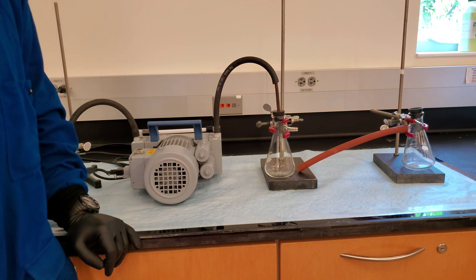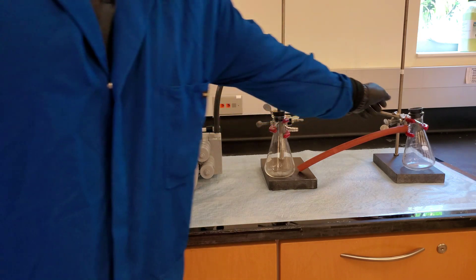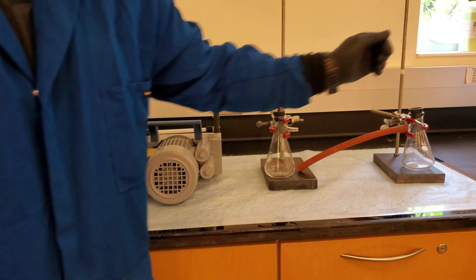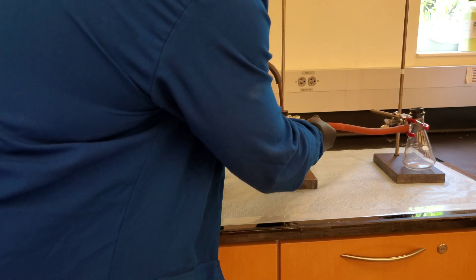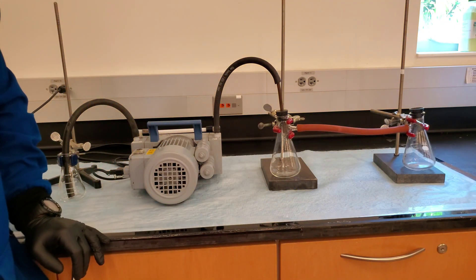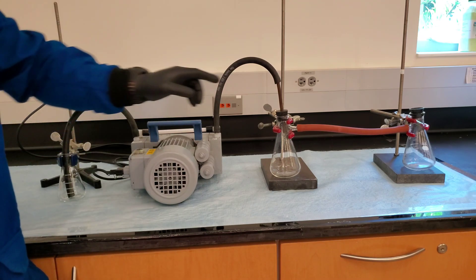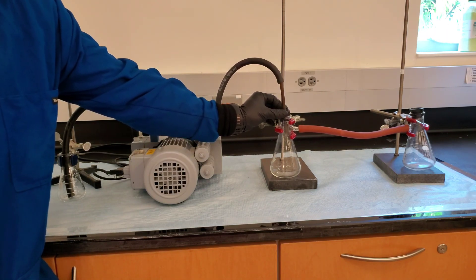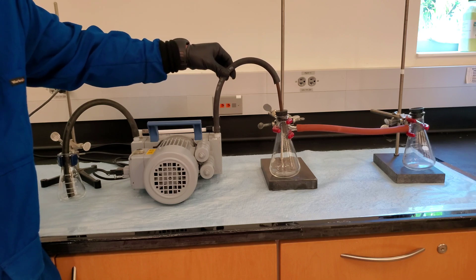Clamp both of your filter flasks to support stands or a fume hood frame. Connect the vacuum hose between the arms of the filter flasks. Fit the one hole stopper with the hose outlet to the filter flask closest to the vacuum pump. Connect the vacuum hose from the one hole stopper hose outlet to the vacuum pump inlet.